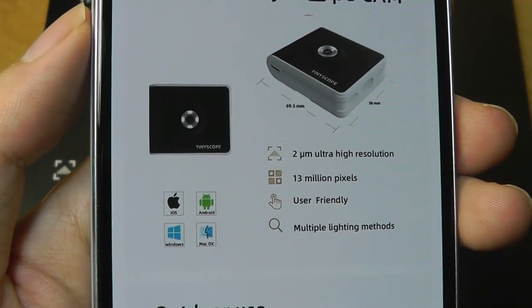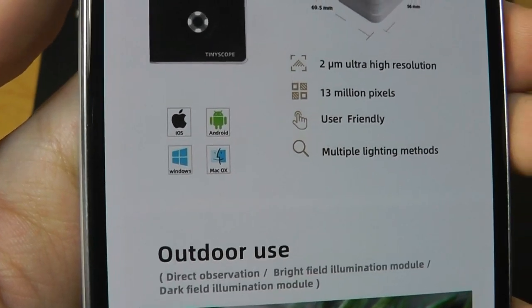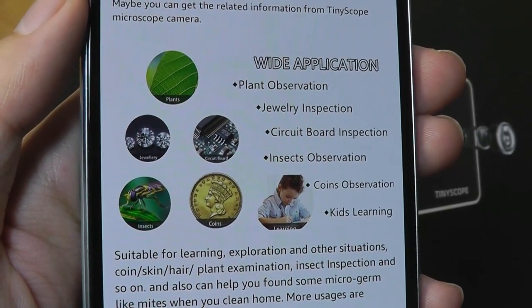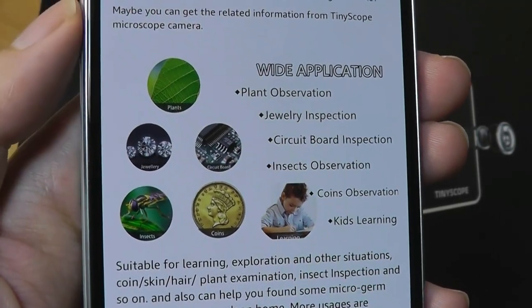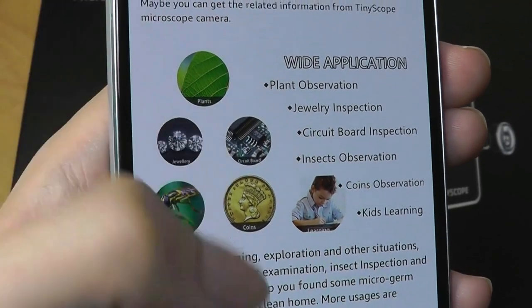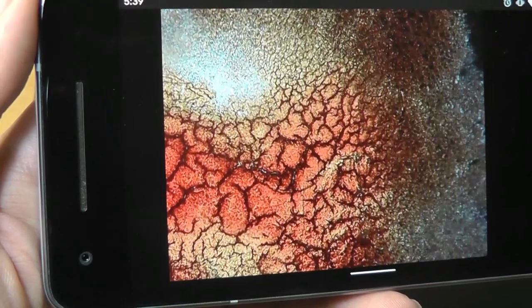The camera itself has a 13MP resolution, and it works for both iOS and Android as well as for computers. A lot of phones these days are beginning to adopt a macro lens, which technically gets pretty close up to objects, but with a microscope like this with up to 1000x magnification, it's still going to give you more detail than what a built-in sensor on most phones currently have.